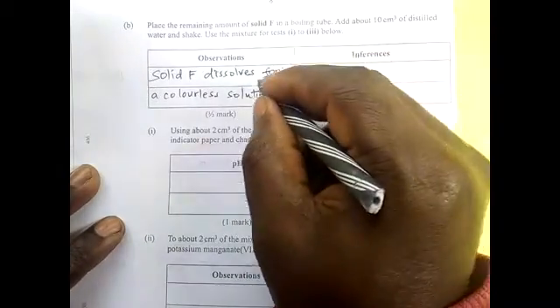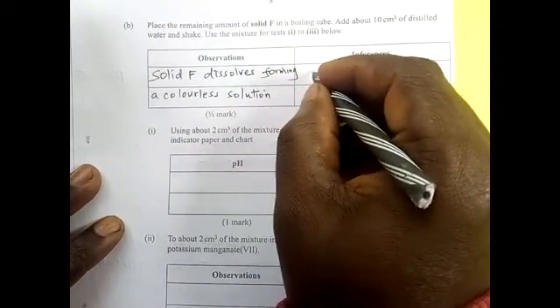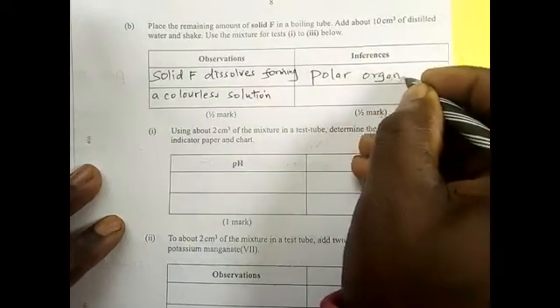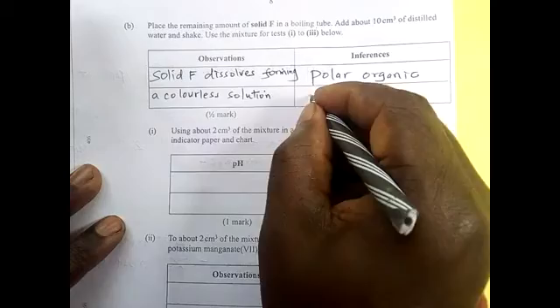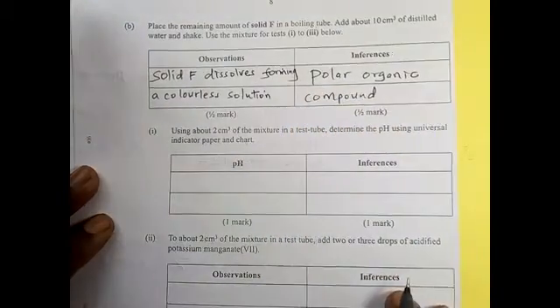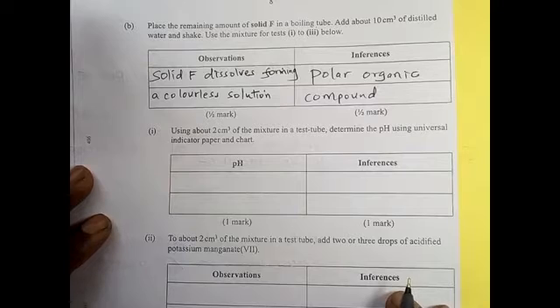That means that the solid is a polar organic compound. A polar organic compound is a compound which dissolves in water. The one which does not dissolve is called non-polar.